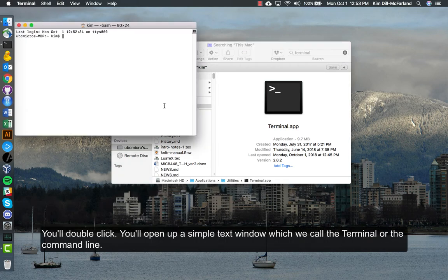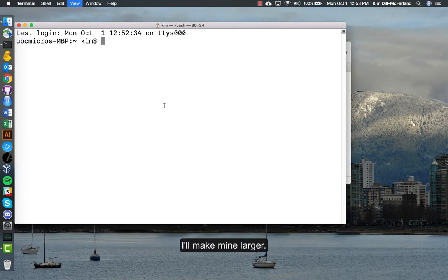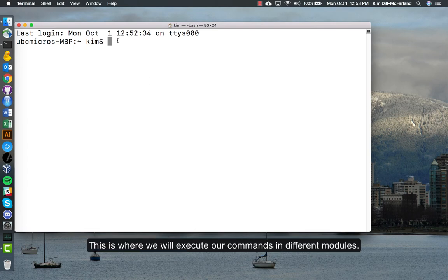We double click, you'll open up a simple text window which we call the terminal or the command line. I'll make mine larger. This is where we will execute our commands in different modules.